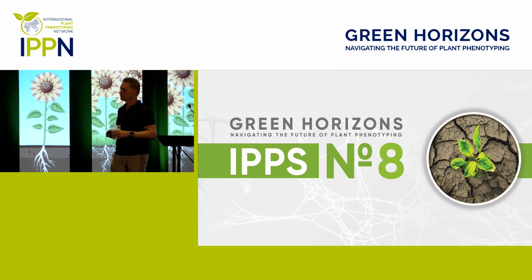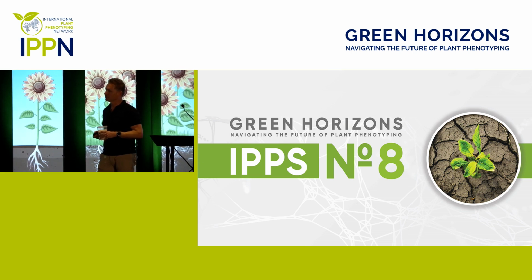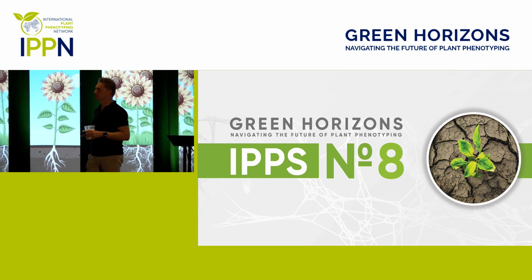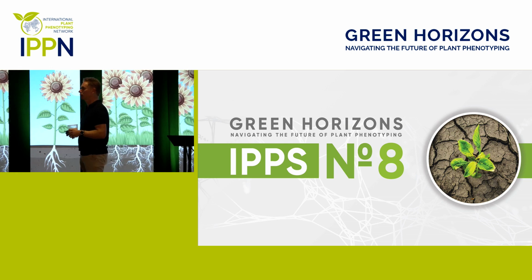So it's amazing what you can reveal, what is normally hidden. My understanding was that if you do a CT scan one time on an organism, that's quite fine. But if you do it a number of times, you see retarded growth. Yet you show that you follow your plants over time. Have you tested what happens to a plant with the amount of doses that you apply?